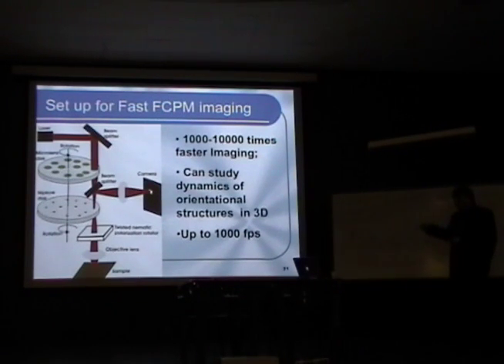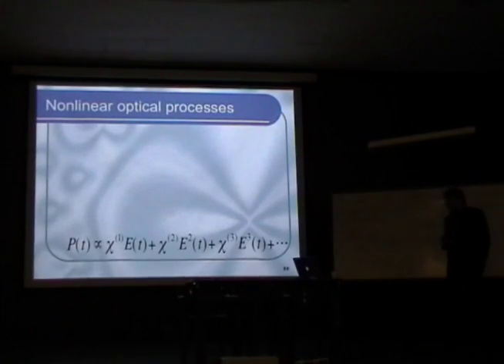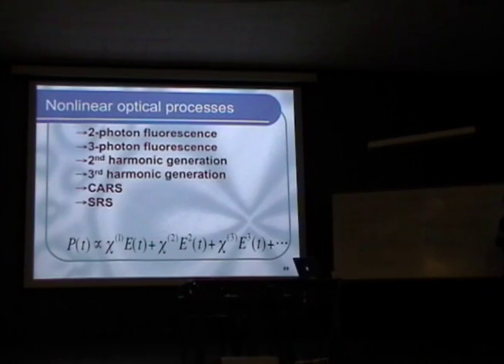Right, so we have illumination through the set of pinholes and detection by use of the very same set of pinholes in a rotating spinning disk that allows the sample to be scanned at much faster rates, and so the confocal imaging done using this approach can be 1,000 to 10,000 times faster, and therefore, especially if using fast cameras in this approach, one can achieve confocal scanning at the rates of about 1,000 frames per second, and therefore, this approach can be utilized to study dynamic processes too. So it essentially gives us also temporal resolution.